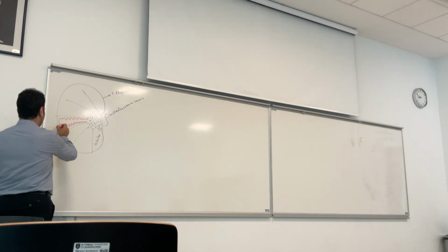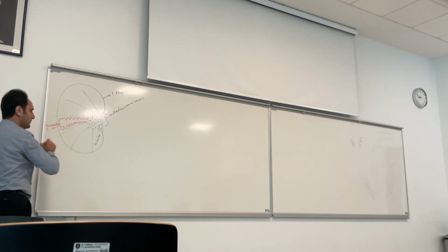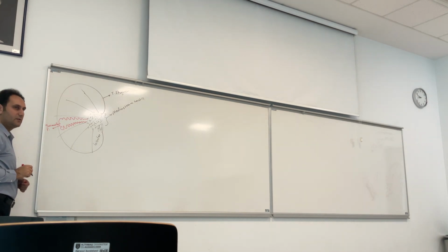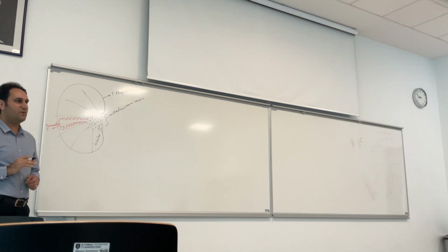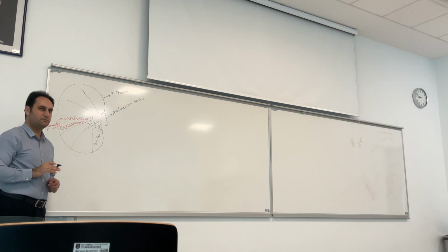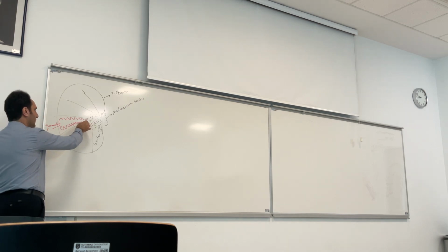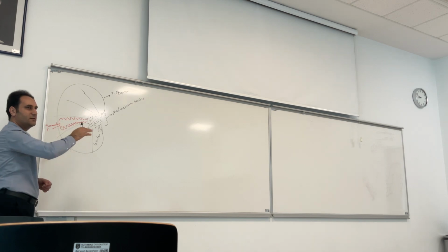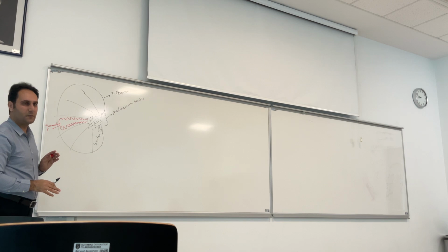This is our seminiferous tubule. In the inner side of each lobule, we have one, two, or four seminiferous tubules. These tubules form a continuous structure, not interrupted, in the inner side of the lobules.